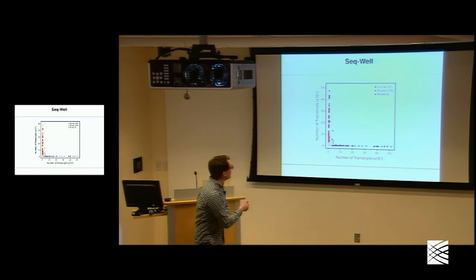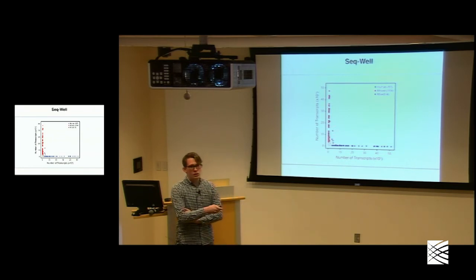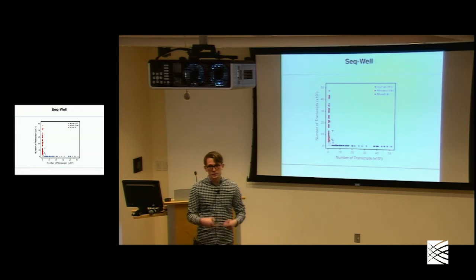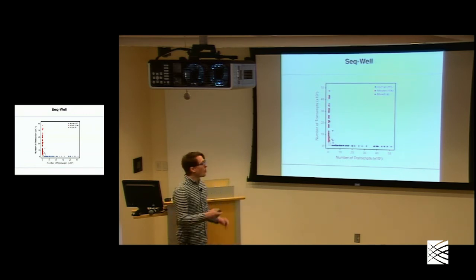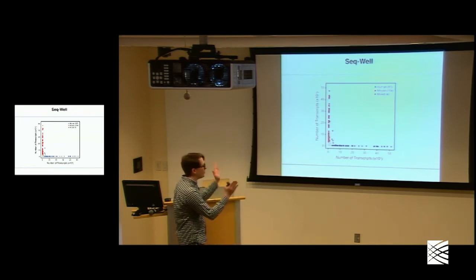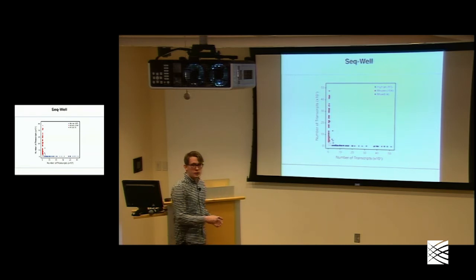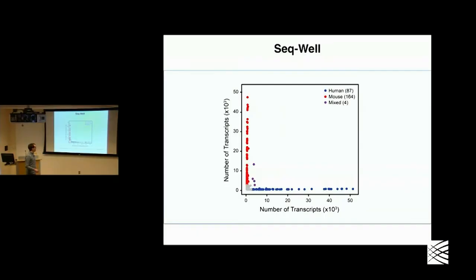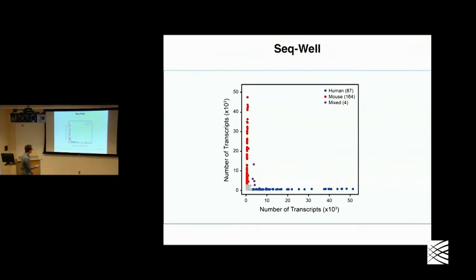Here the mixing would indicate that these are actual doublets in the wells. For more mixing, what we would actually see is a bowing in along the axes — if there's just nonspecific cross-contamination, we would see a bowing in. But here we see very straight lines along the axes, so we think these are more likely to be actual doublets.